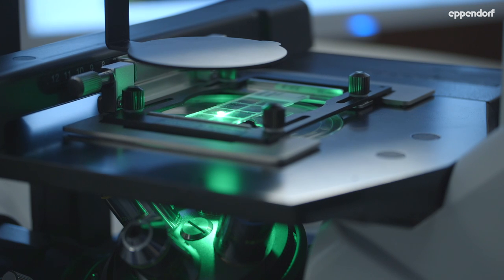Eppendorf cell imaging slides and cover glasses. Revealing the beauty of your fluorescent cells.